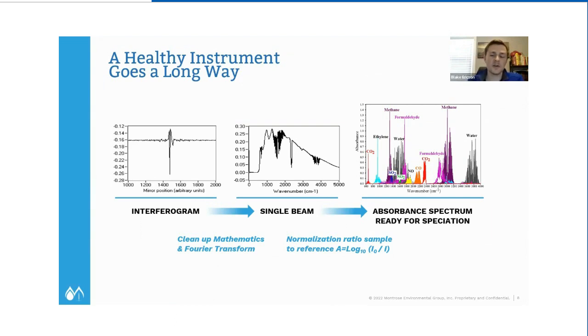So the beauty of the FTIR to me is that regardless of how the data was collected, as long as it was collected in a proper way, we can go back and verify those numbers and validate to see that, hey, that number is real. Yeah, that one's not so real, but we can add or subtract compounds and clean up the analysis a little bit. So a very well-trained person, a well-trained eye, will be able to tell if some things are going wrong with the recipe and sampling development.